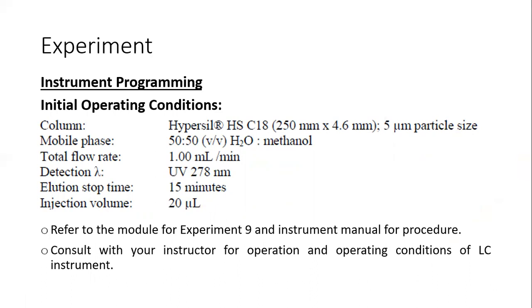So the conditions for the instrument operation, the mobile phase that will be used is a 50 to 50 water to methanol. And since ang detector natin ay UV-Vis, you need to program as well the wavelength at which you will detect your analyte. So yung caffeine, it has a lambda max of around 278 nanometers. So dapat you need to set the lambda max of your detector to that. Okay.